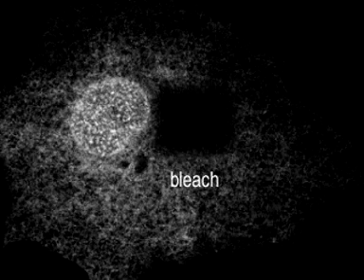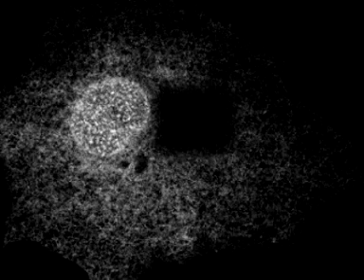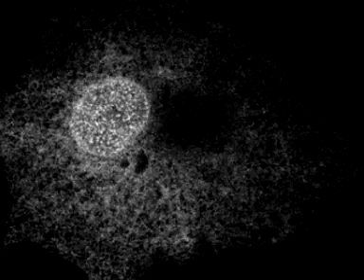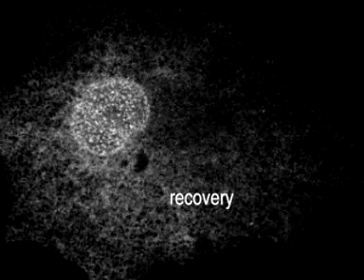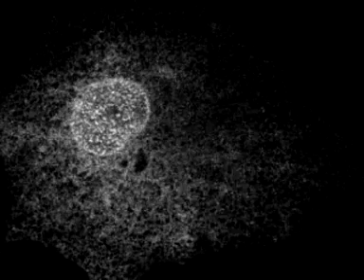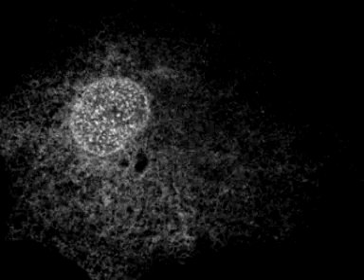After bleaching, we observe quick recovery of the fluorescence, showing that the protein is very mobile in the plane of the membrane.